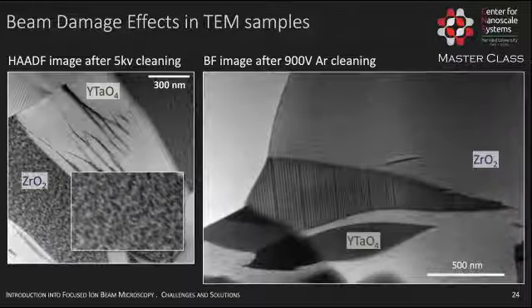For anybody who has not had a chance to see Nikki Watson's talk and is interested in this topic, I highly recommend it. It is a wonderful introduction into how to prepare such samples. In recent years, vitrification has become more and more prominent, of course, with the Nobel Prize. And this is sort of the future for focused ion beam microscopy.